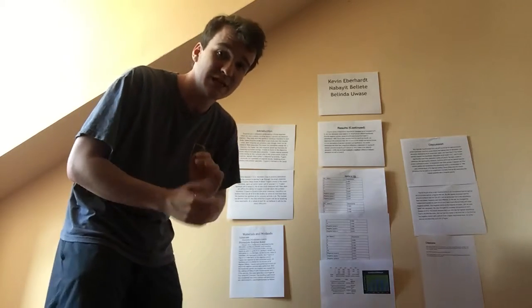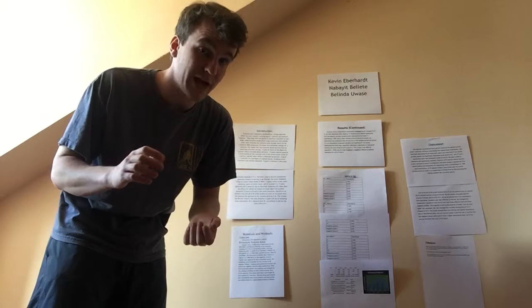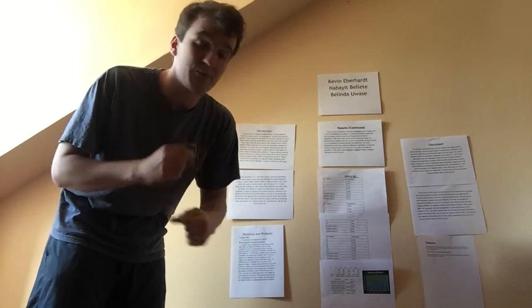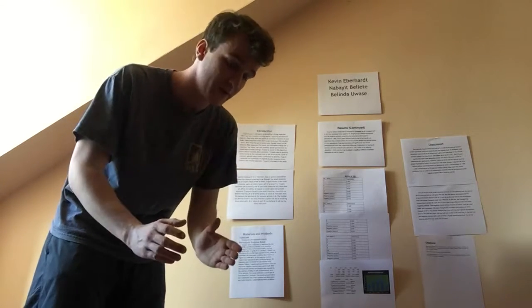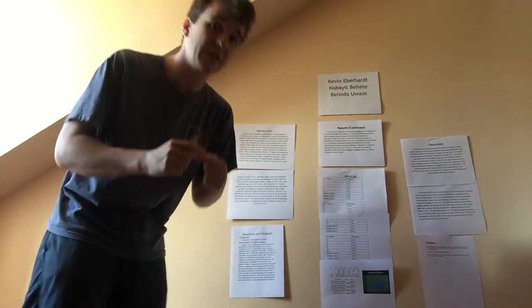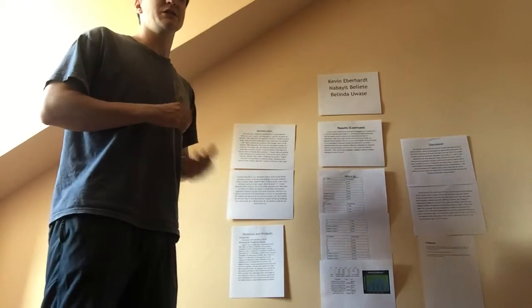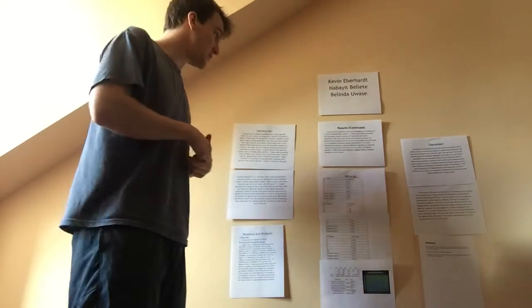And what that does is it denatures the proteins and completely stops the reaction from occurring. So trypsin will stop breaking down. So we have this 20-minute period where we can say, all right, this is where the reaction's occurring, and that allows us to more easily compare the reactions at the varying levels of pH that we had.